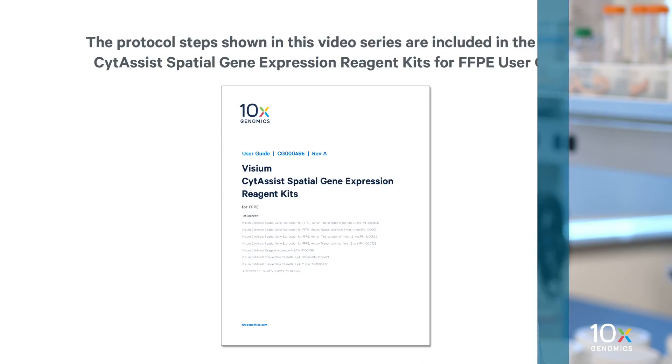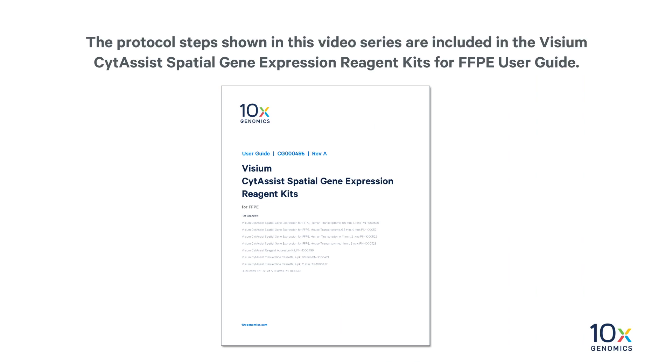We have decross-linked the tissue. Now we will perform probe hybridization. The protocol steps shown in this video series are included in the Visium CytAssist Spatial Gene Expression Reagent Kits for FFPE User Guide.